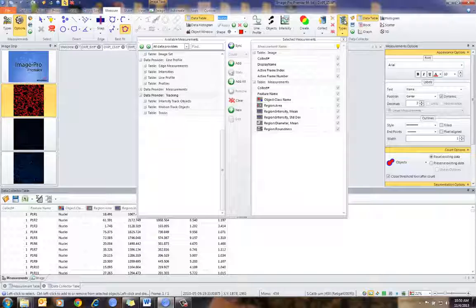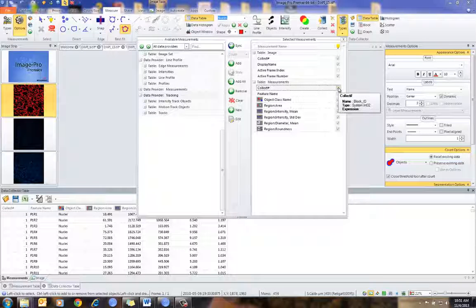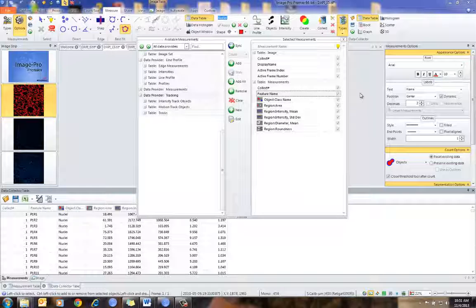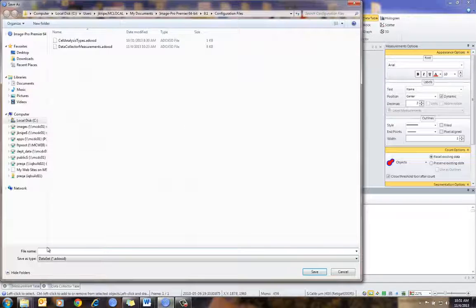Again, I can add or change this information. I can choose what information to show or not show by simply turning off these checkboxes. The important thing now is I want to save this — if I have this set up correctly, I want to simply save this table or the setup.